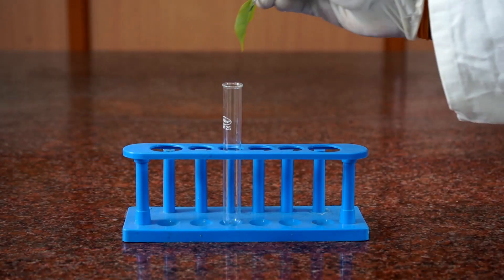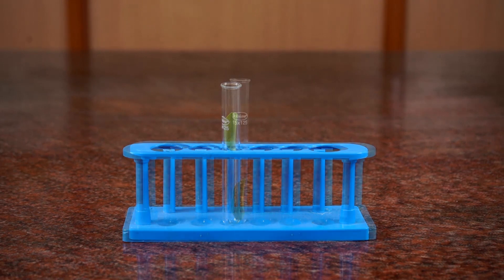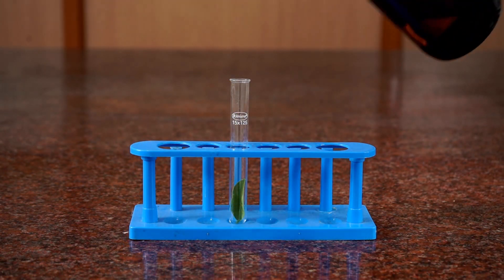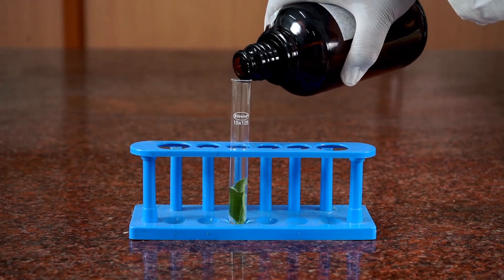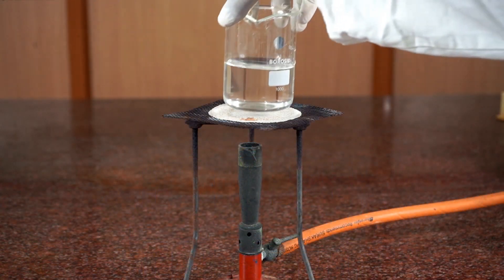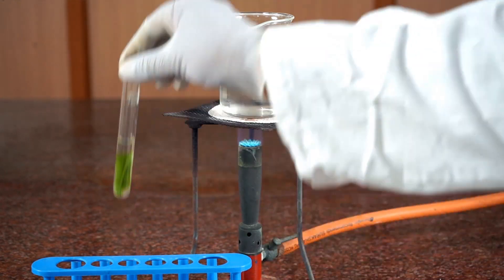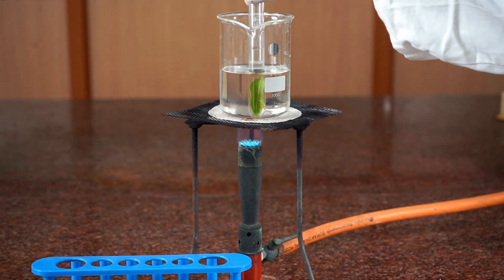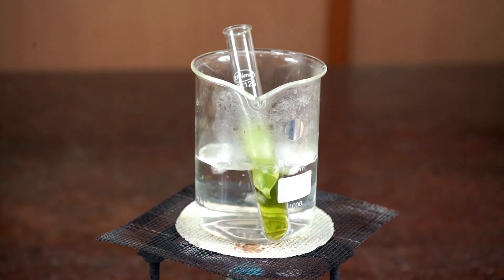Procedure: Take a leaf and insert it into a test tube gently with the help of forceps. Pour spirit into the test tube so the leaf thoroughly dips. Place the beaker on a tripod stand and keep the test tube in a beaker half-filled with water.